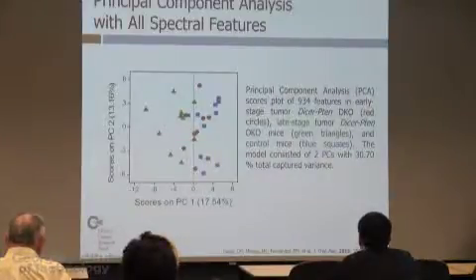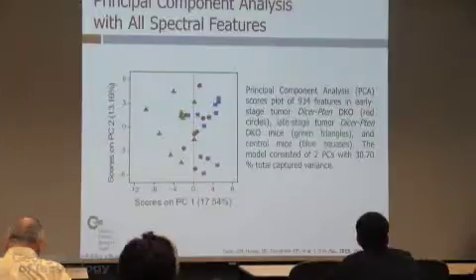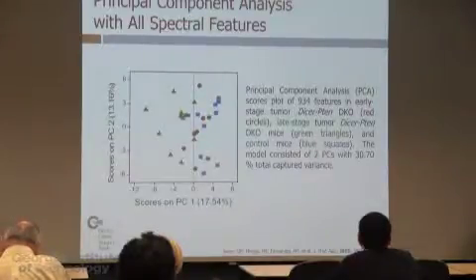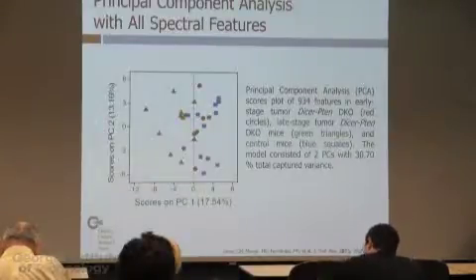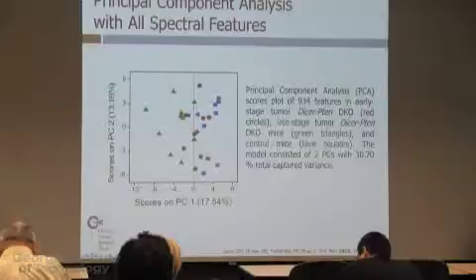So this was a little disappointing, but we're like, look, wait a minute. First of all, PCA is trying to capture the things that are the most different. Late stage is so different, these mice are extremely sick, that it's obvious that that's different from the other two sets. So that in itself confounds the analysis a little bit. So what we did is we took away the late stage samples from this data set, and we stuck to the early and controls.